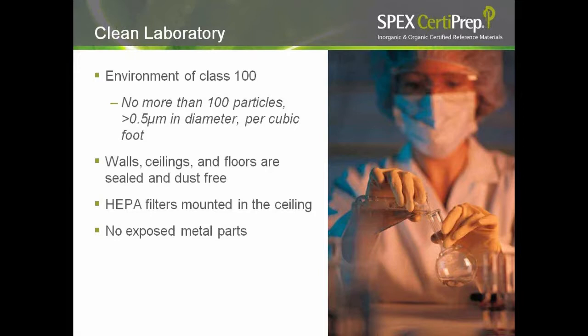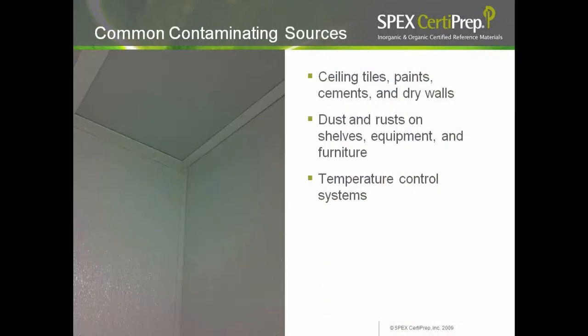If a full-blown clean room is too expensive, you can use a clean hood to prepare your samples. Common contaminating sources in a regular lab include ceiling tiles, paints, cements, and dry walls — dry walls can give high calcium and lead contamination. Rust on shelves, equipment, and furniture can give iron contamination. Carbon and silica can come from your temperature control systems.